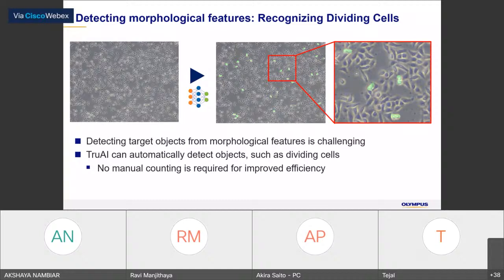But of course, it is better to have high contrast. But by giving training to the neural network, it will show a very good result even in a very low contrast image.